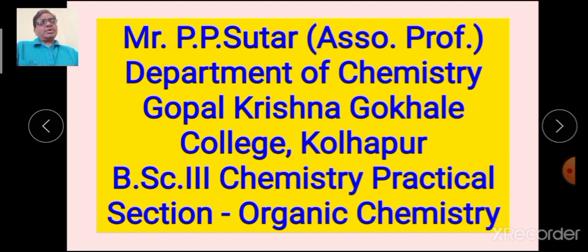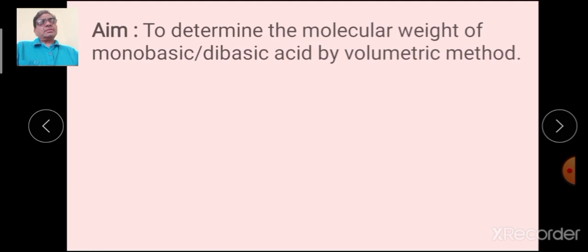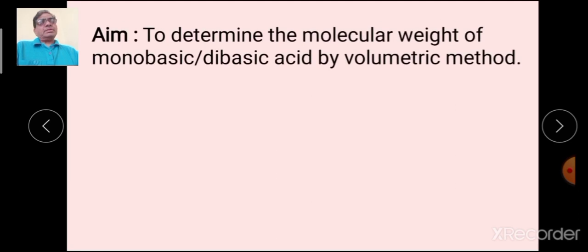I am going to teach you a few practicals. Let us start the first practical of organic estimation. Number 1 is to determine the molecular weight of monobasic or dibasic acid by volumetric method.